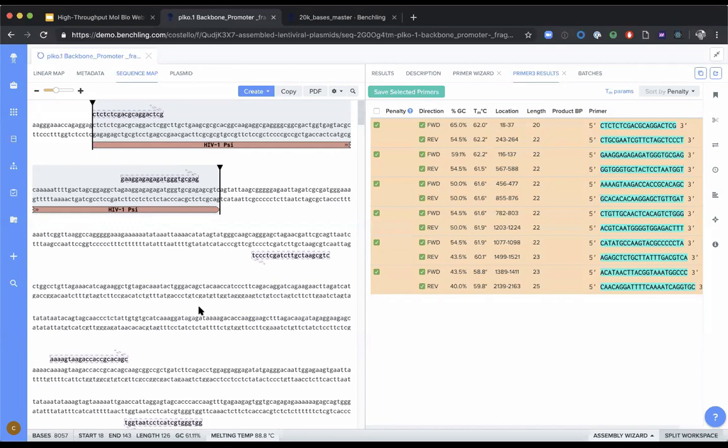So it looks like we have about 1 or 2 minutes, maybe 1 or 2 questions, before we wrap things up. Yeah, so I'll answer the last couple of questions. Can you automatically detect homology? That's something we're working on over the next 3 months: taking your constructs and automatically finding those flanking regions for you, to speed up the process of assembly. Another important one: will this webinar be available later on?